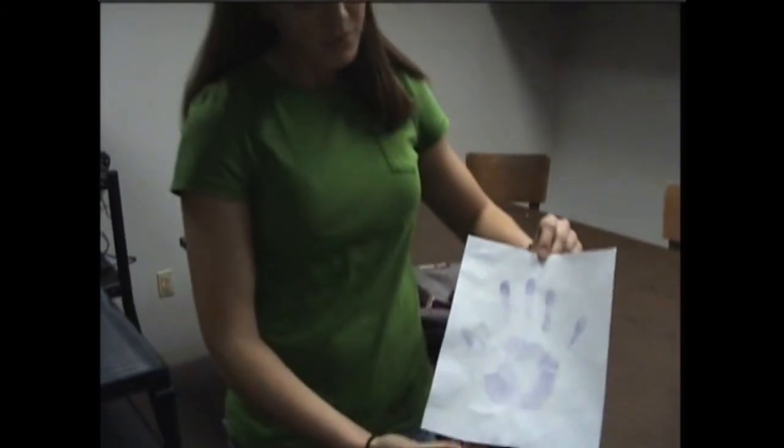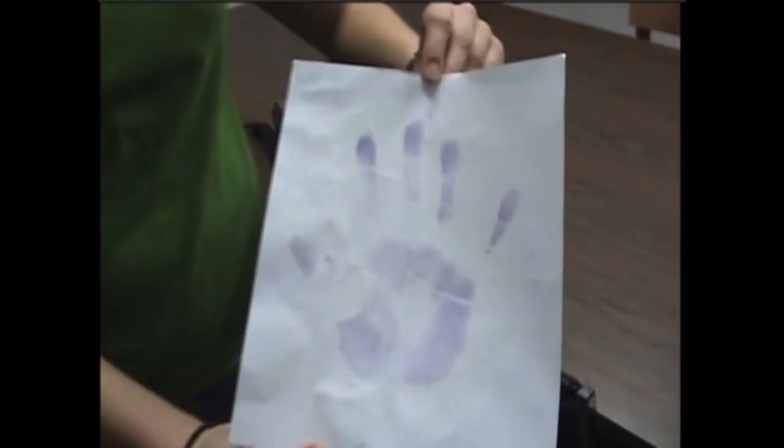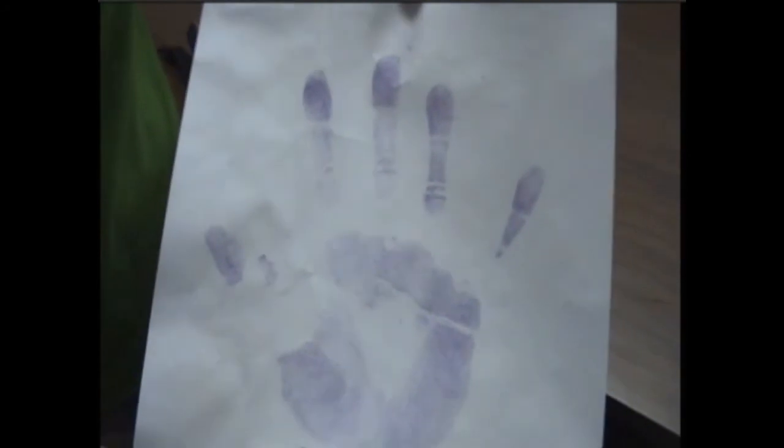Okay, here we are — it's the next day. As I mentioned before, it takes about 24 hours for a print to show up when using ninhydrin, and here is our result. You can see every arch, every little piece of detail when using ninhydrin. It usually only works on porous surfaces, such as paper.